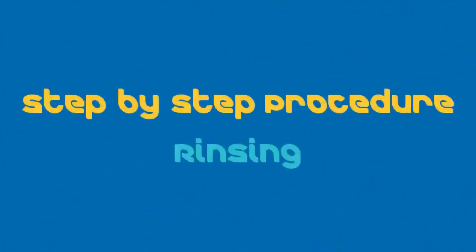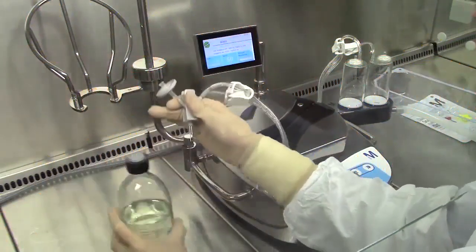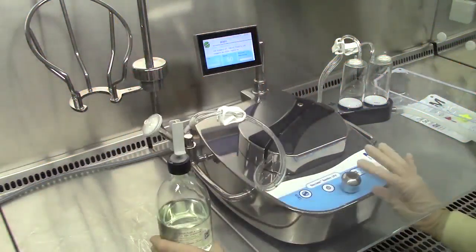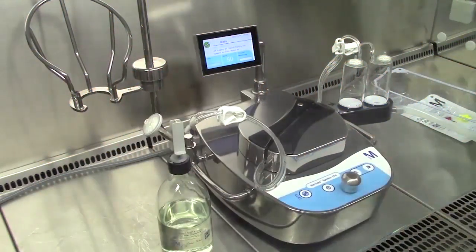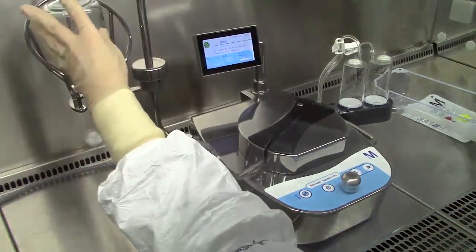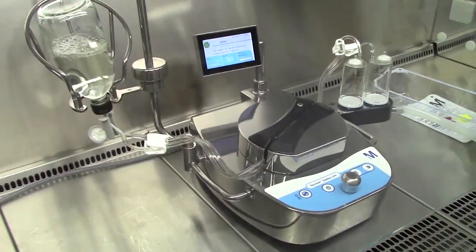At this step, a low speed is recommended to maximize the contact time between the rinsing fluid and the membrane. Aseptically insert the tube set needle through the septum. Start the pump. Invert the rinsing fluid bottle and install it in the bottle holder. Transfer 100 milliliters of rinse fluid into each canister.